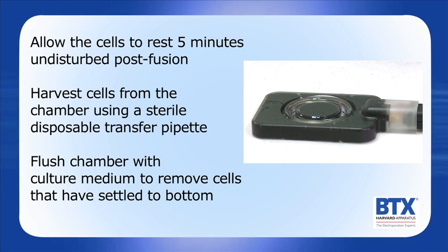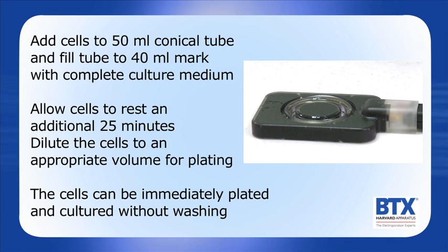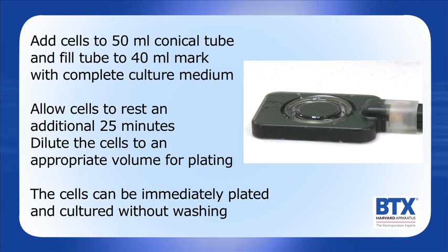Harvest cells from the chamber using a sterile disposable transfer pipette. Flush the chamber with culture medium to remove cells that have settled to the bottom. Add cells to a 50 mL conical tube and fill the tube to the 40 mL mark with complete culture medium. Allow cells to rest for an additional 25 minutes. Dilute the cells to an appropriate volume for plating. The cells can be immediately plated and cultured without washing.